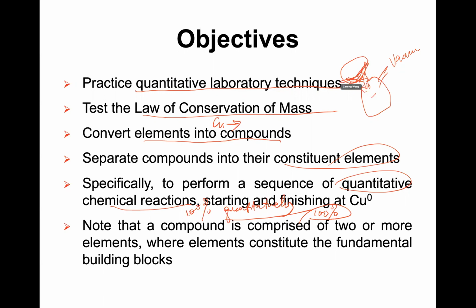Once you put the mass on top and the liquid filters off, even if your reaction is 100% complete, you still have some mass remaining on the filter paper. You will not 100% remove it from the filter paper. So you want to do something there.